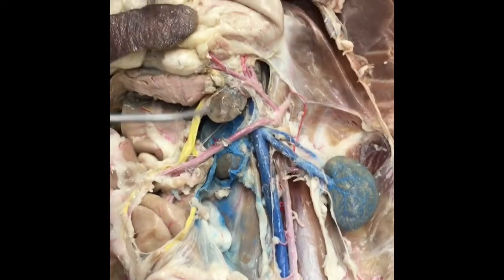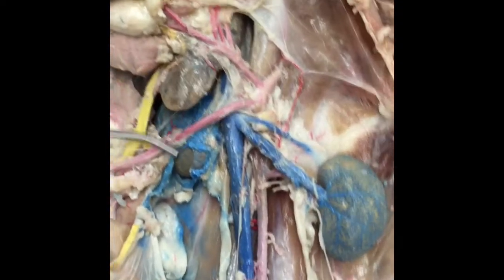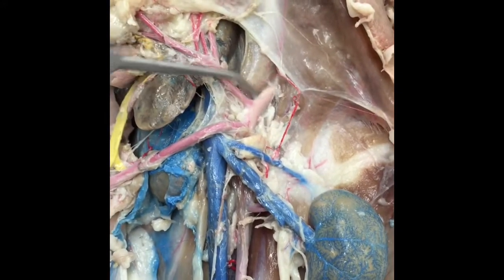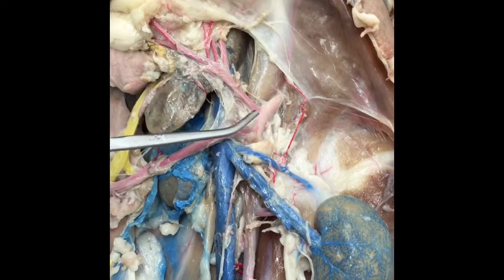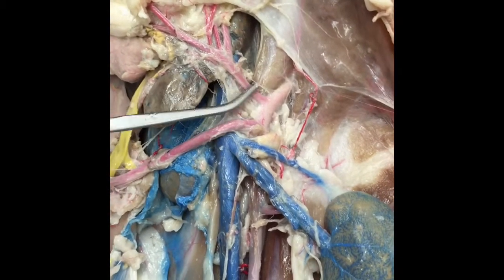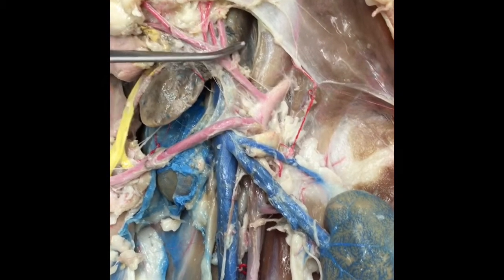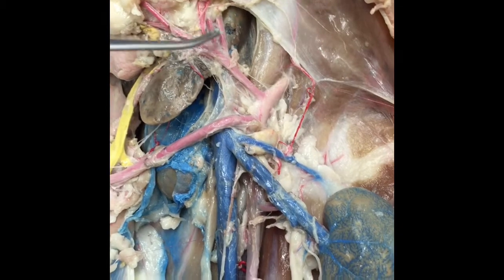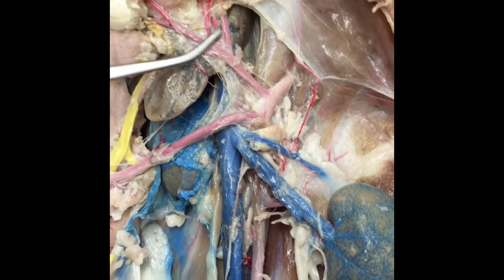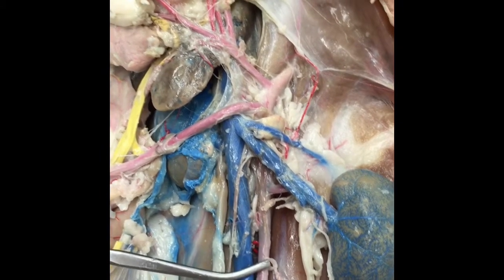Okay, this is the cranial mesenteric artery, and then this one's the dorsal aorta, or dorsal artery, and then this is the coeliac artery, and then this is the hepatic artery, and then these are the gastric artery, left gastric artery, and then this is the splenic artery, and this is the inferior vena cava.